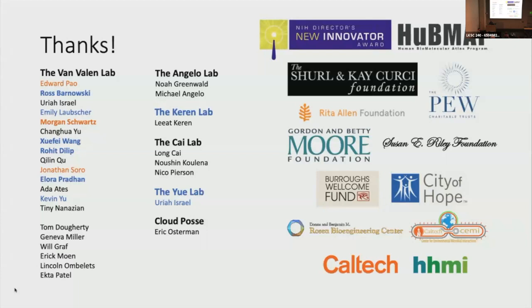And so yeah, we've ingested well over 20 different data sets. I want to say it might be closer to 30 now. Many millions of cells. Some of them come with labels, and we know that of those that are labeled, some are good, where we don't think there's any additional work that has to get done. Some are not good, and they just effectively need to be relabeled.